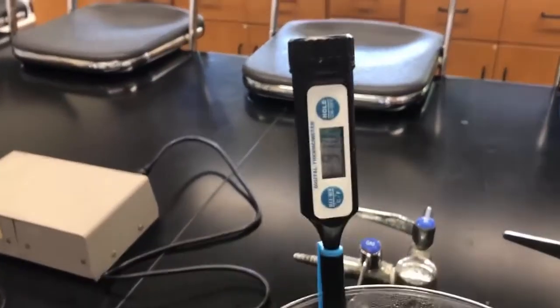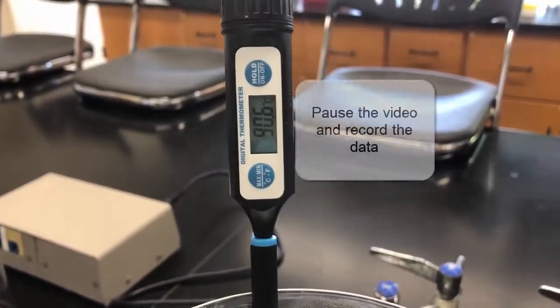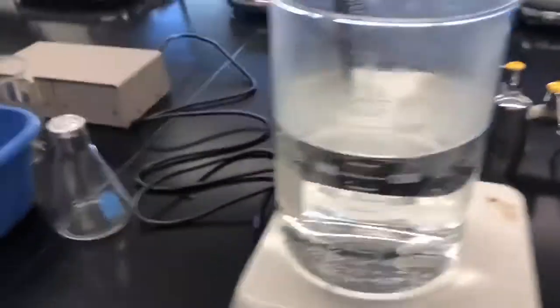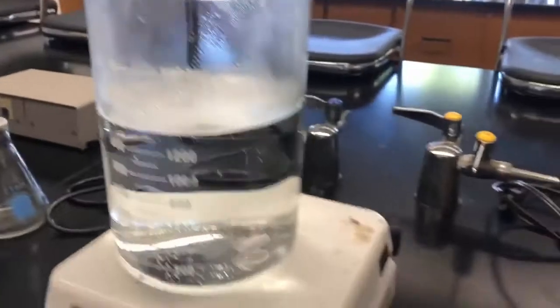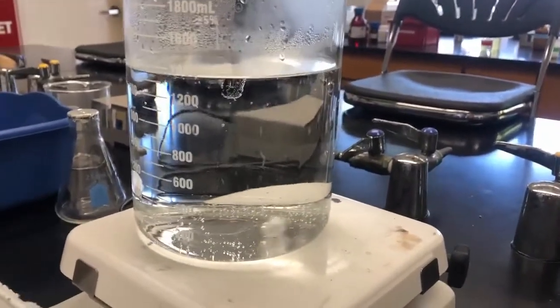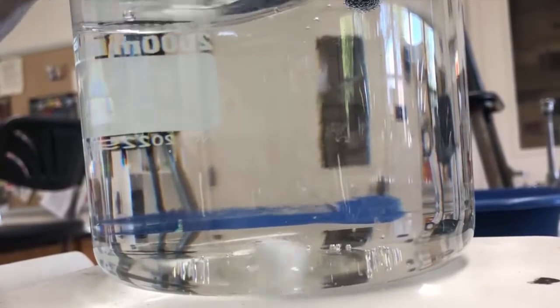We're just about ready to go in and make our measurements. That's the temperature of the water right now — it's been pretty steady. I have my flask and I'm going to have to hold this, so I'm going to put the camera down. I used a bigger beaker than they recommend because it gives a better view of what's going to be happening inside the flask. The temperature of the water is the same as it was before.